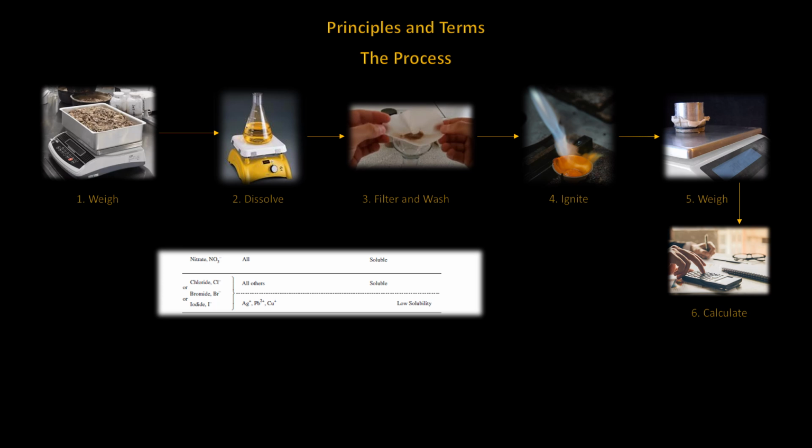For example, a silver nitrate standard solution will be used for the calibration of an inductively coupled plasma mass spectrometer. This solution has been on the shelf for quite some time. Although it was stored correctly, its strength needs to be determined for it to be considered as a primary standard. More on primary standards later. In order to determine its concentration, the silver nitrate will need to be converted to silver chloride. Potassium chloride will be chosen as the reagent.